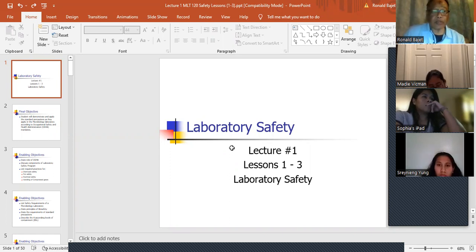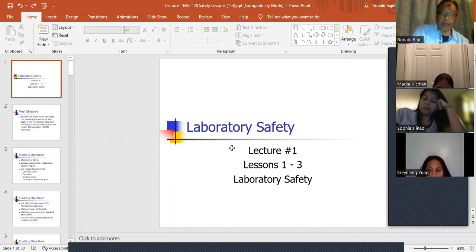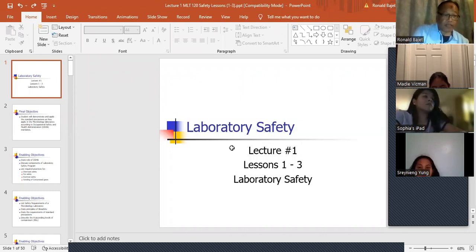But the difference between the two, Proteus vulgaris and Proteus mirabilis, is the indole test. Vulgaris is indole positive. So you'll be getting a flowchart of the Enterobacteriaceae, the Ewing flowcharts, and you'll see how to distinguish between the different species. Okay, moving along.